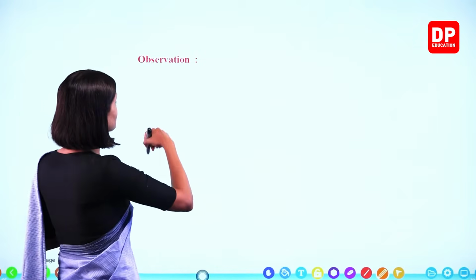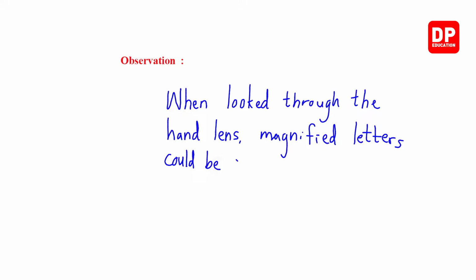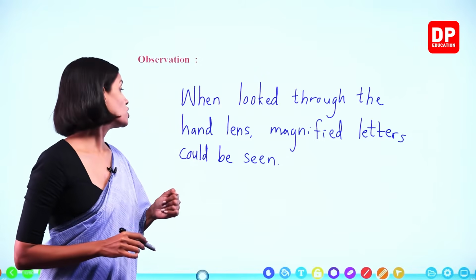Right, so observation here. When looking through the hand lens, magnified letters could be seen.